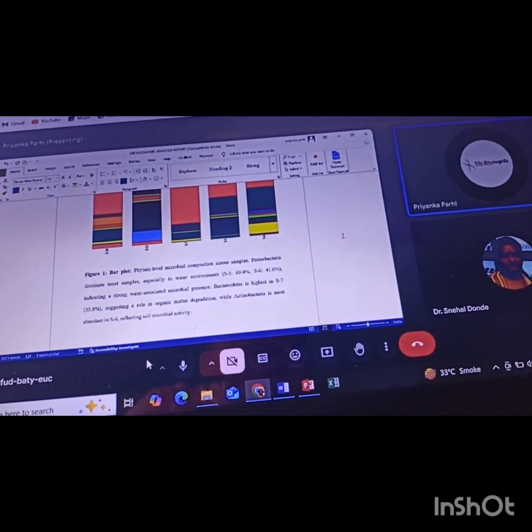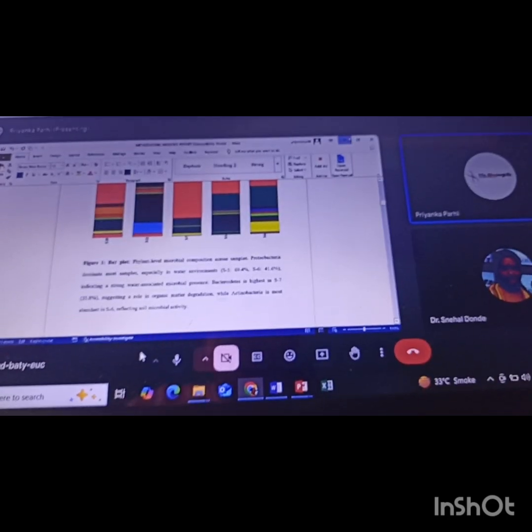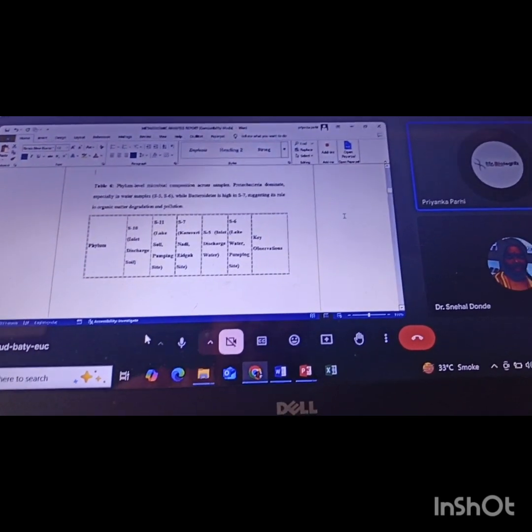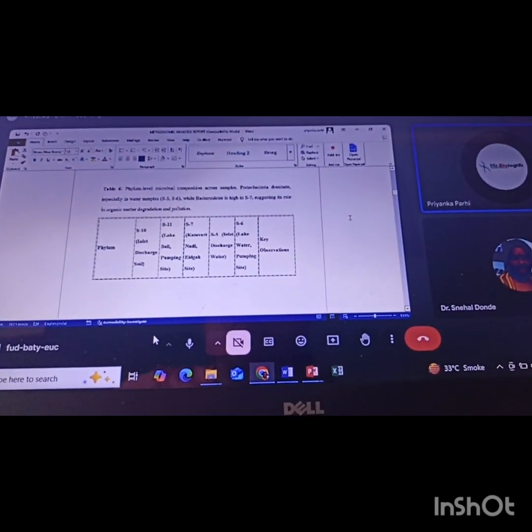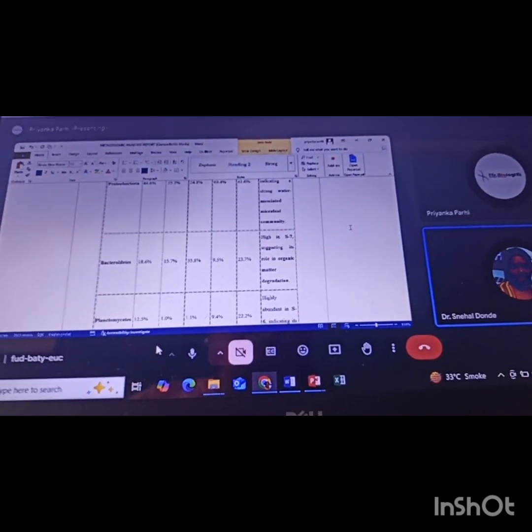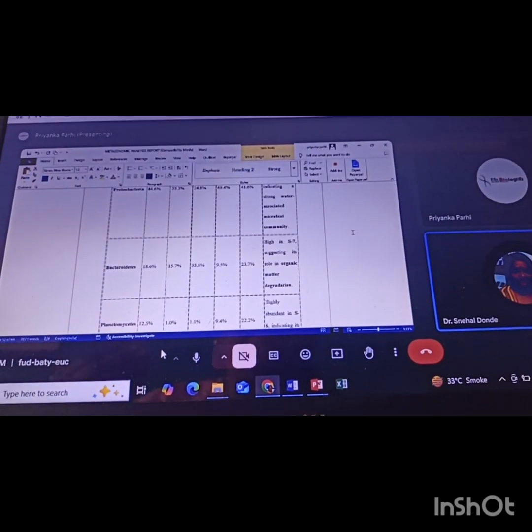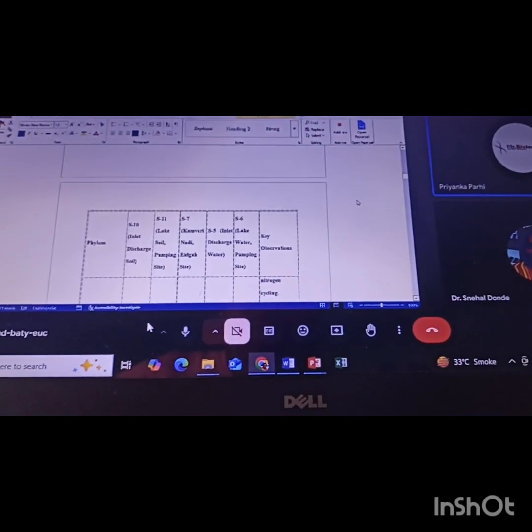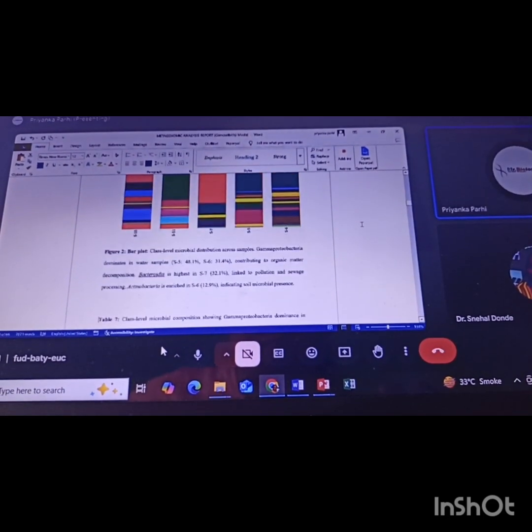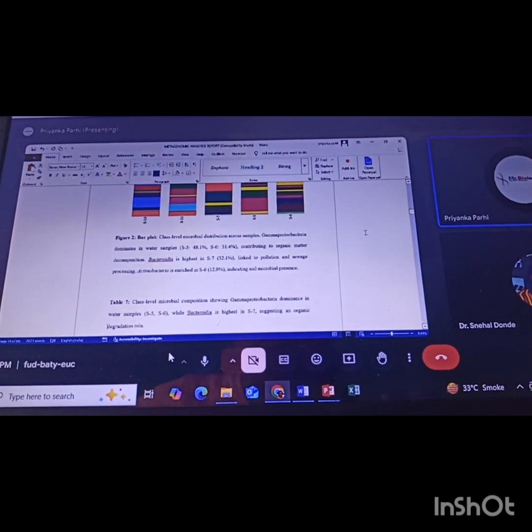I will make small remarks under every bar plot. Yeah, that this red signifies this and this. Okay. So for every bar plot, I have written the phylum, what is the key. This is the percentage generated by the software. Yeah, but then here it is on the basis of phylum, because I saw that it's phylum, class wise, and that's how you have gone. Basis of phylum, yeah. Then after phylum, you will also find class level distribution. Yeah, same, I will make for every bar plot.